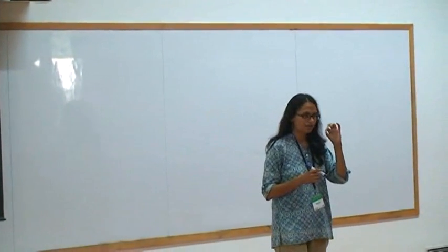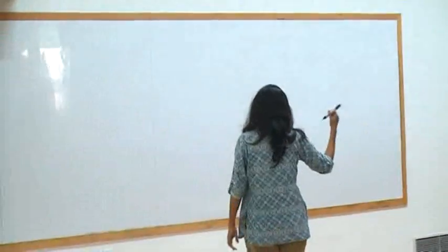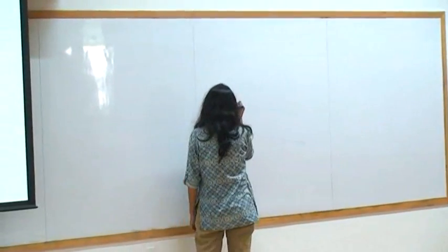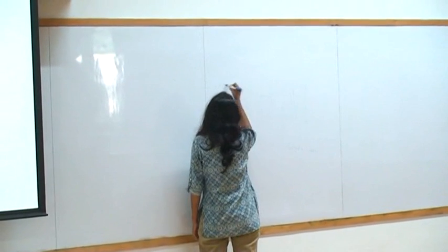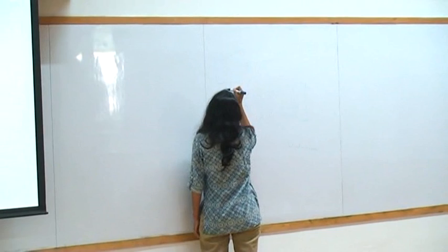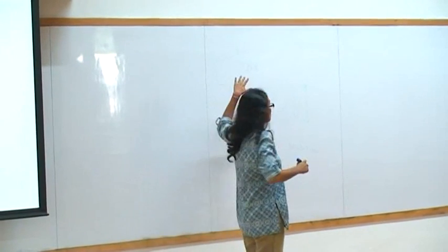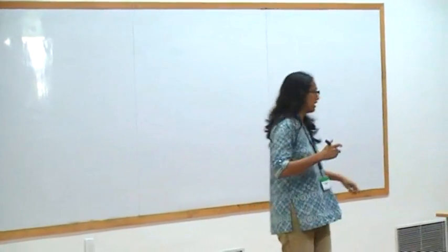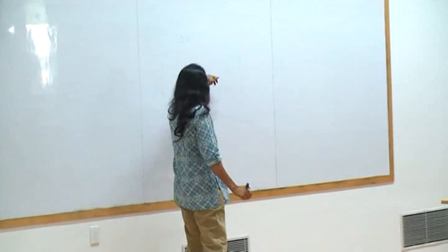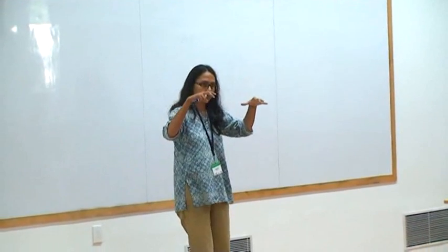We are working with 100 micron thin PDMS sheets. If we go beyond this, in fact, yesterday we tried an experiment with the cells were nice. So usually we work 0.5 and 1. If we try to make something which is 1 and 1 or 0.8 and 1, it starts to become more strong. But if you can handle it, fine. But you have to remember that when you put the silicone grease, it again creates a sort of non-uniform pressure on it. So all these things one has to keep in mind.